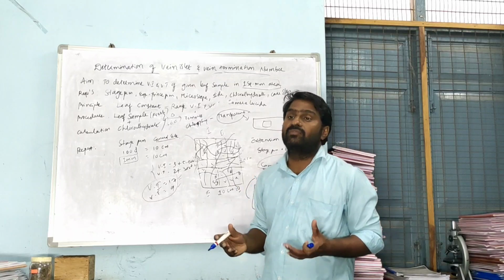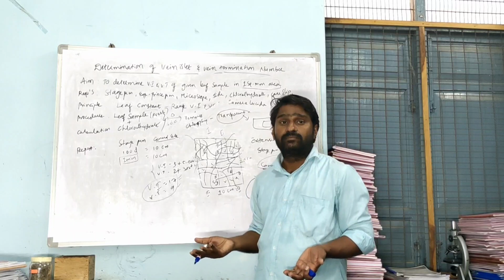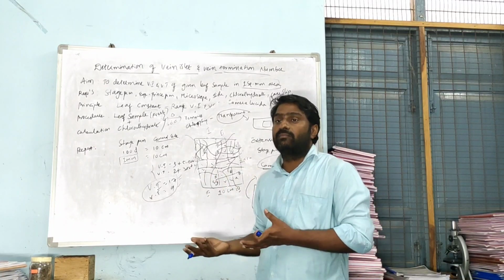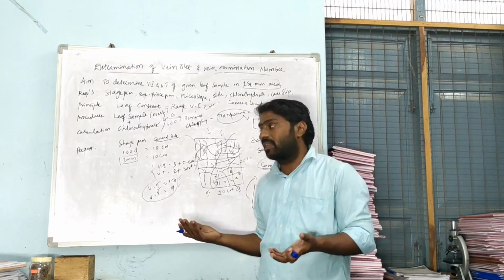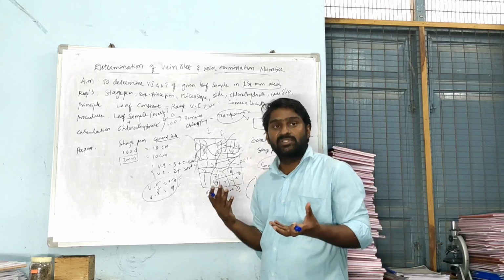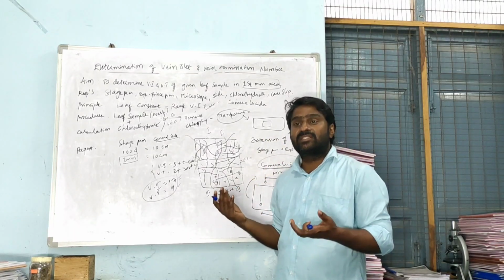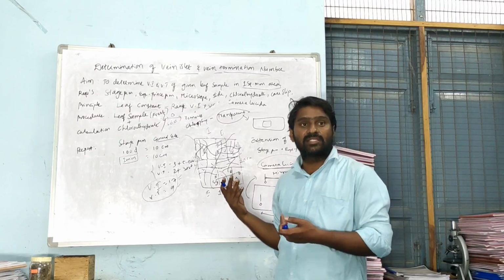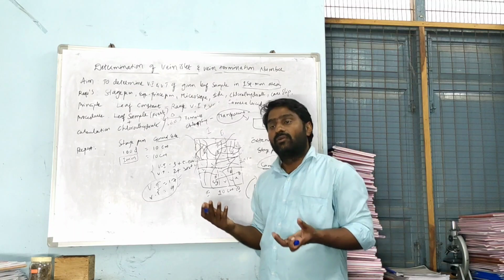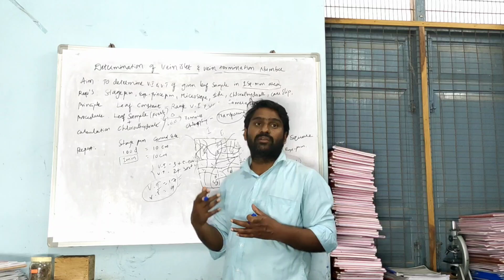As they are directly obtained without any processing except drying, they may have some other constituents or foreign matter with them, or else similar looking substances, similar looking leaf samples, may be added to them because of cost or scarcity. So definitely there is a chance of adulteration, a chance of adulterated drugs being available in our laboratory too. So first we are supposed to determine the genuineness, then only such samples can be carried further.